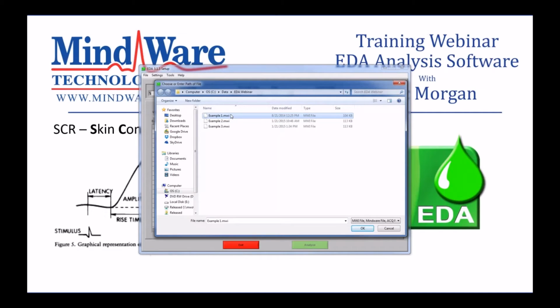Now, you may be familiar if you're using MindWare Mobile, or if you're using the new Biolab software, the file formats MWI and MWX. And those are the newest file formats that we write. And the MWI file is the file that you're going to open when you go to analyze your data. We also support the older .mw file format as well as the acknowledge file format.